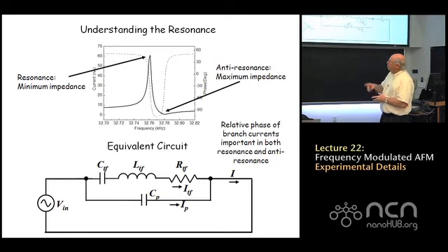So what this is a plot of is the current through the tuning fork as a function of frequency. It's probably about 5 or 10 millivolts applied to the tuning fork, and you systematically vary the frequency of the voltage. We see a very nice peak in the current that flows through the tuning fork. Currents are on the order of 50, 60 nanoamps, right? This peak has a funny shape to it.